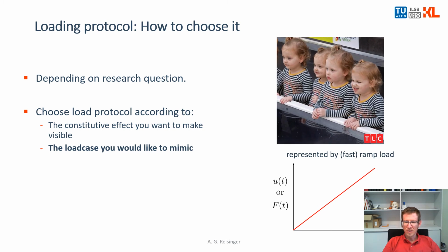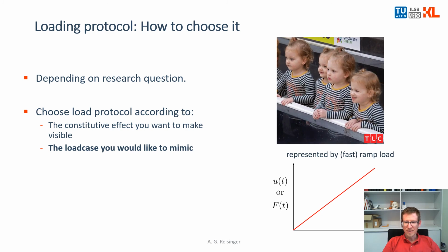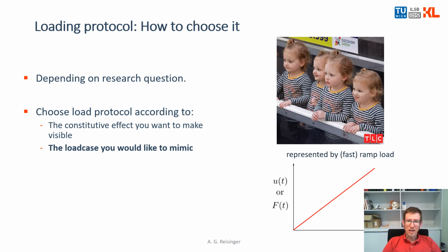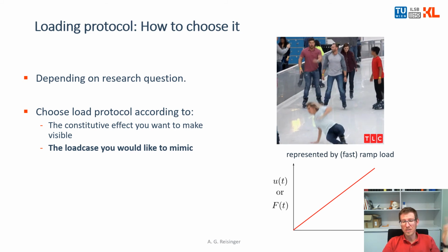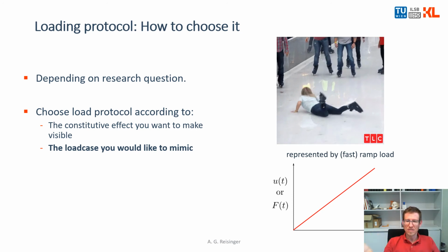So when you know, okay, you would like to have a hit with a certain load, then you can apply a force. Or when you say, okay, I would like to go to fracture, yeah, until the bone fractures, you don't know at which force the bone is fracturing, then you apply a displacement at a certain very fast rate.